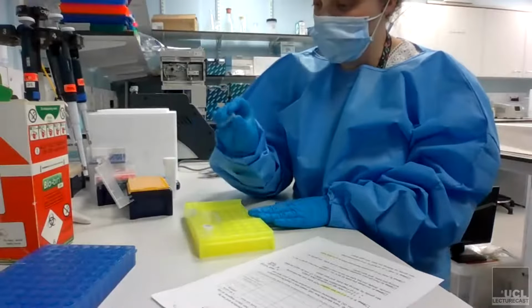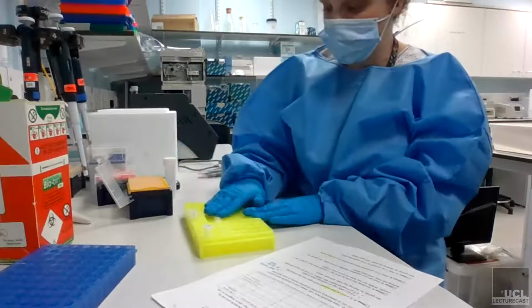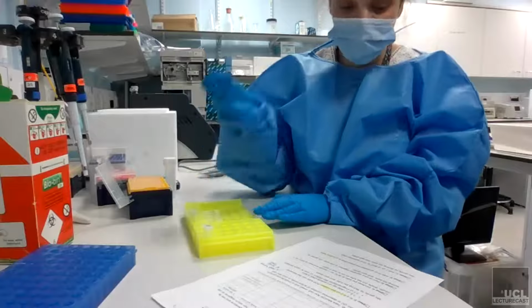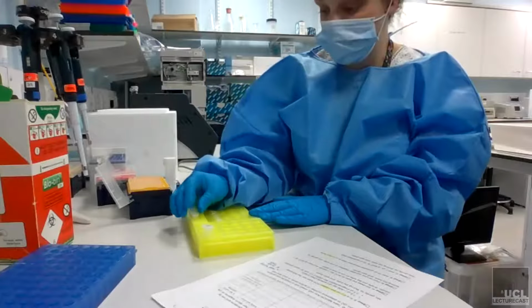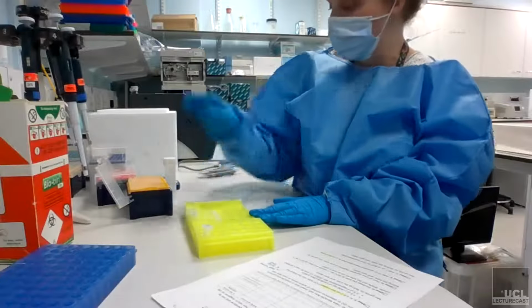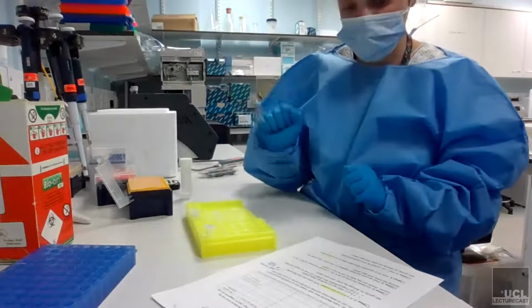Your samples, of course, won't necessarily be the exact amount. So what you'll need to do is work out how to get 400 nanograms. So you'll need to probably water some of them down, or dilute them with your water. So I will just go through and do that now.